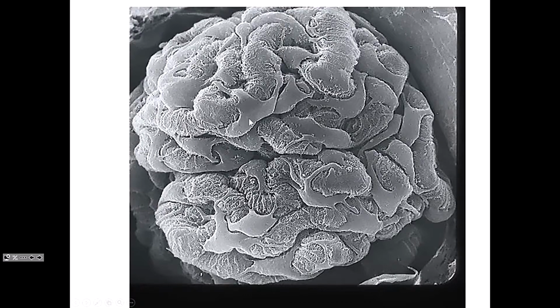Complicated structure, but it's good to see the surface topography of structures because it really gives us a much better understanding of the cells that we've seen in cross-section. Okay, so in combination of scanning and either light or electron microscopy, we can get a much better appreciation of the structure of a particular tissue and the organization.